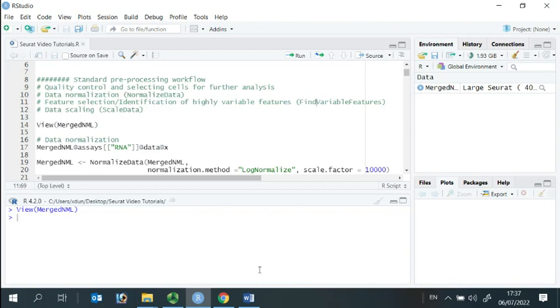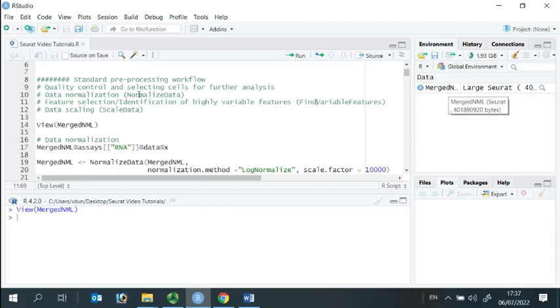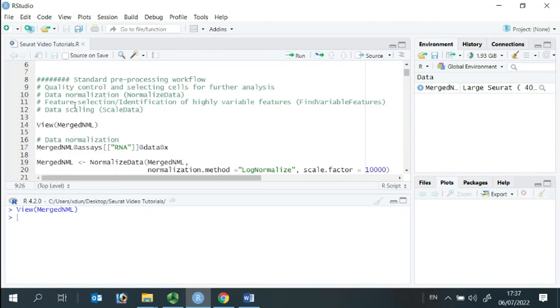We already performed quality control analysis and removed low-quality cells from our Seurat object. Today, we perform the analysis for the remaining three steps: data normalization, feature selection, and data scaling.